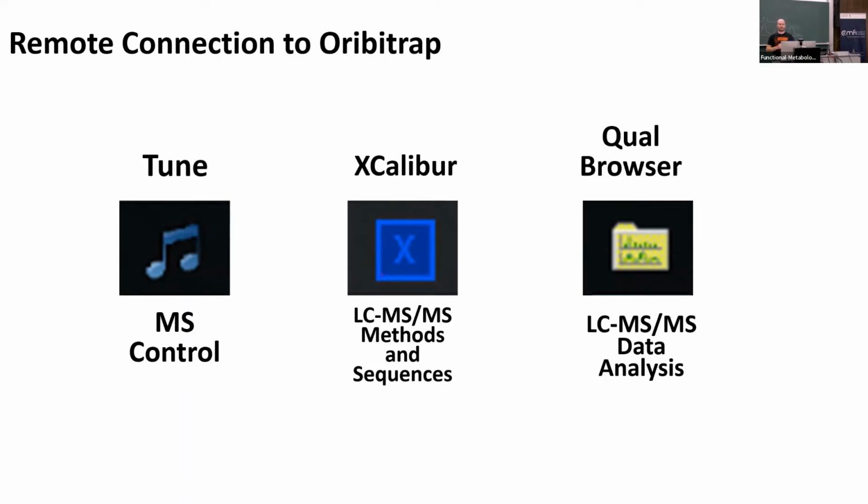I think they try to replace it now with Freestyle. So if you recently bought an instrument, Qual Browser might still be somewhere hidden, but they encourage everybody to use Freestyle. I like Qual Browser better, but I guess that's your choice.